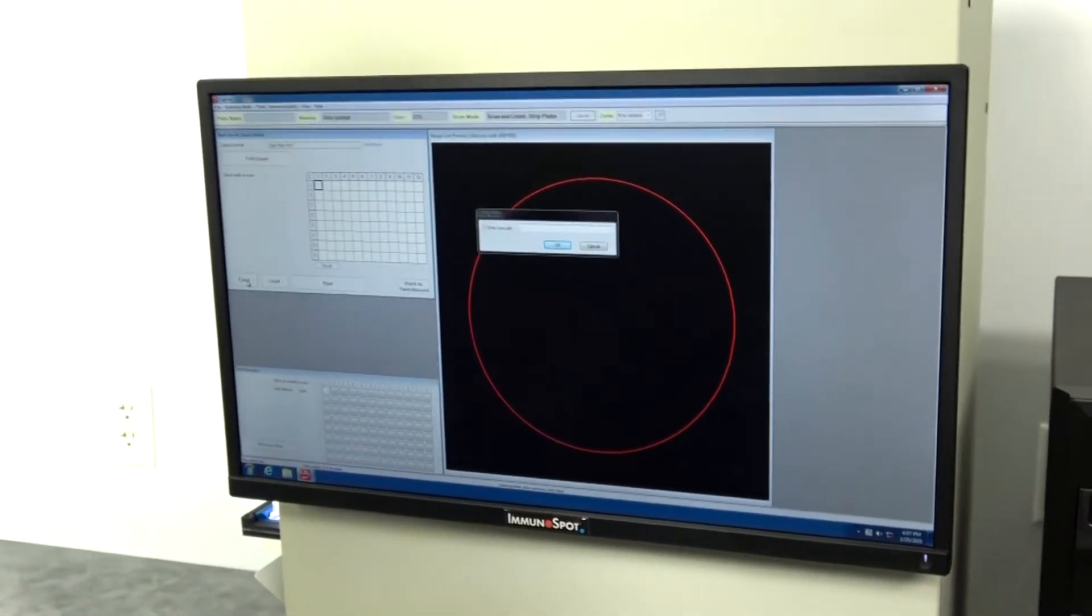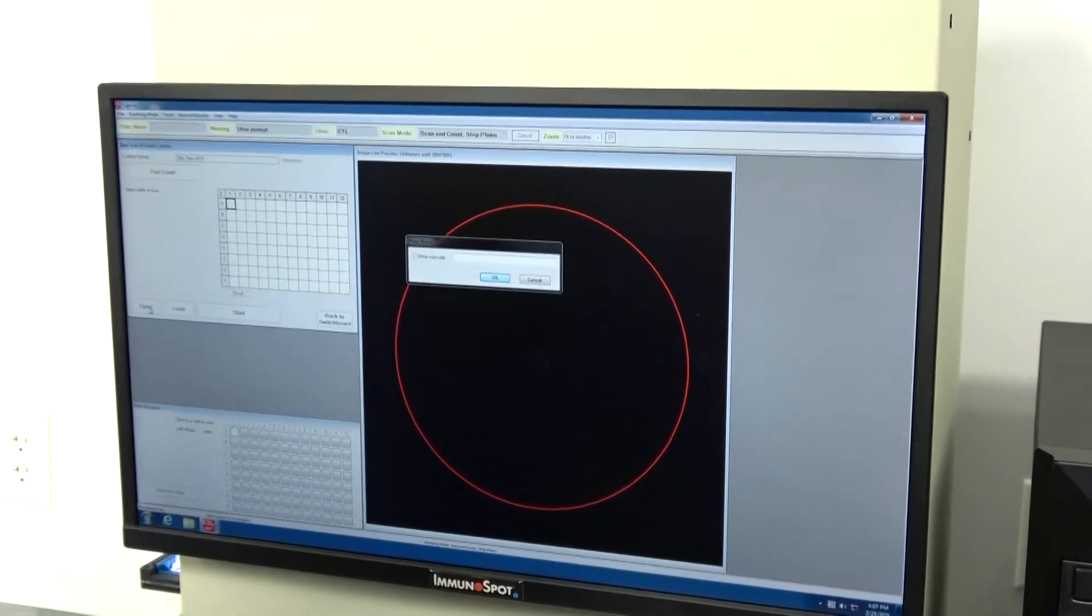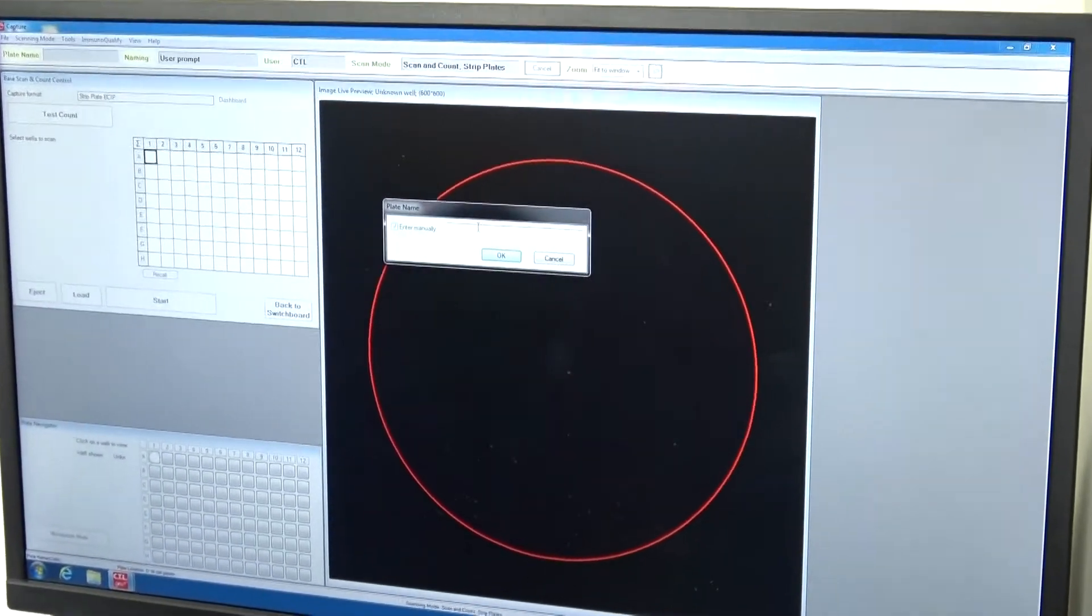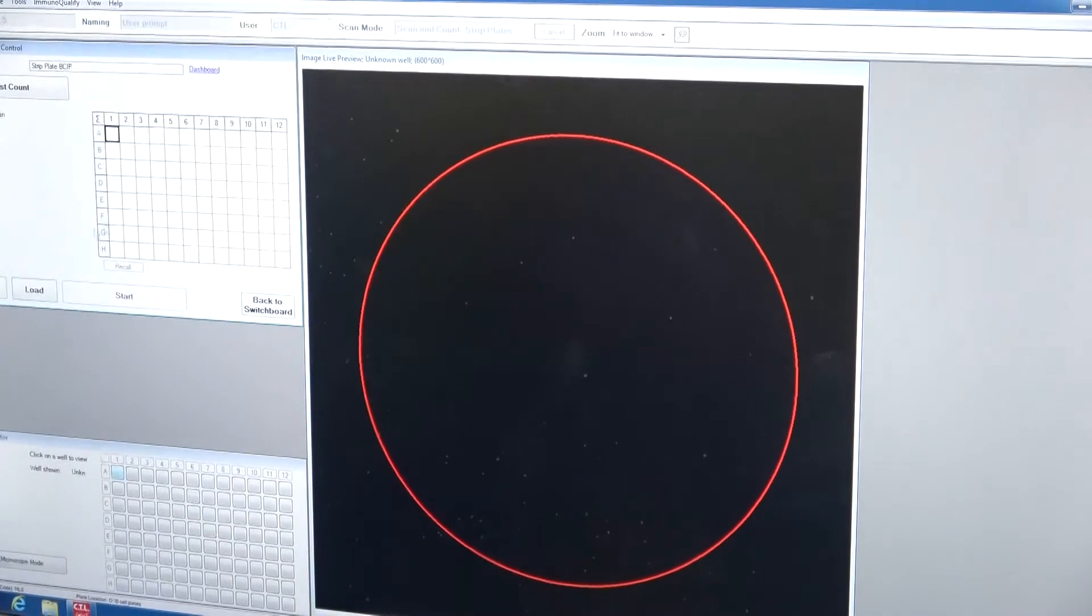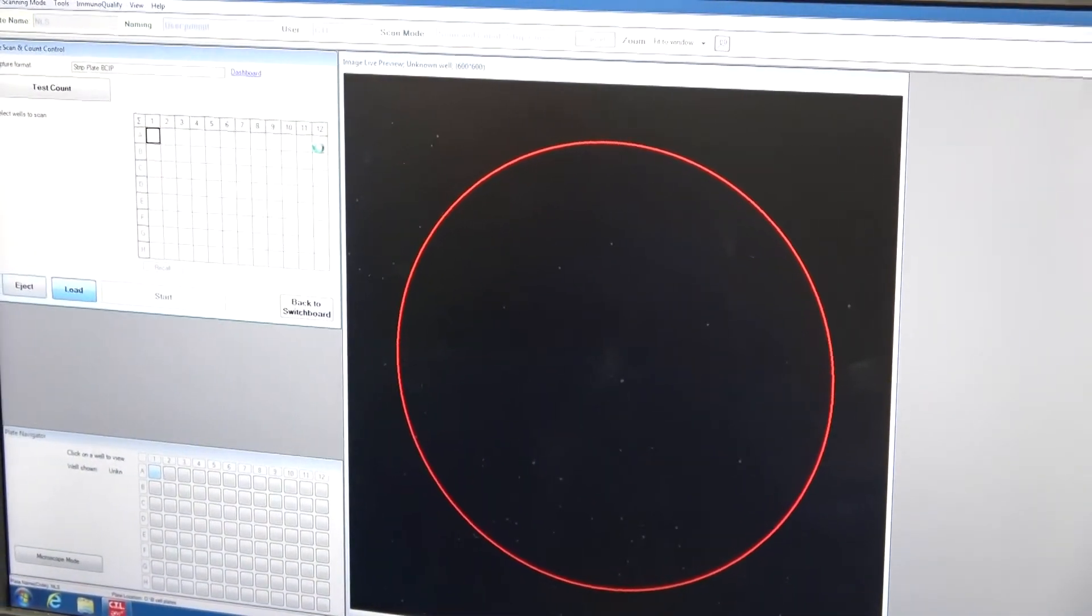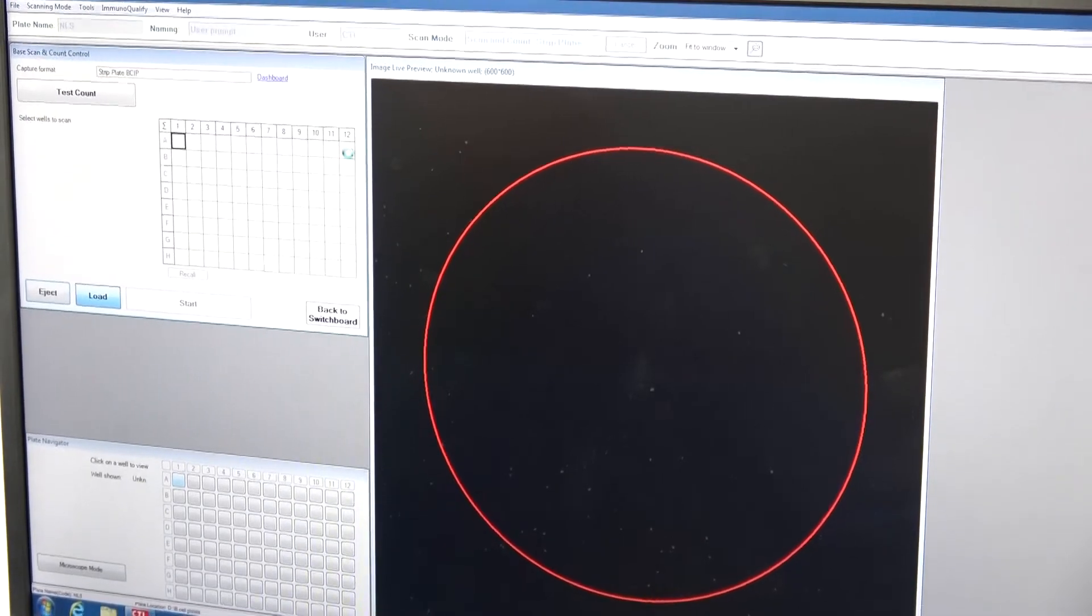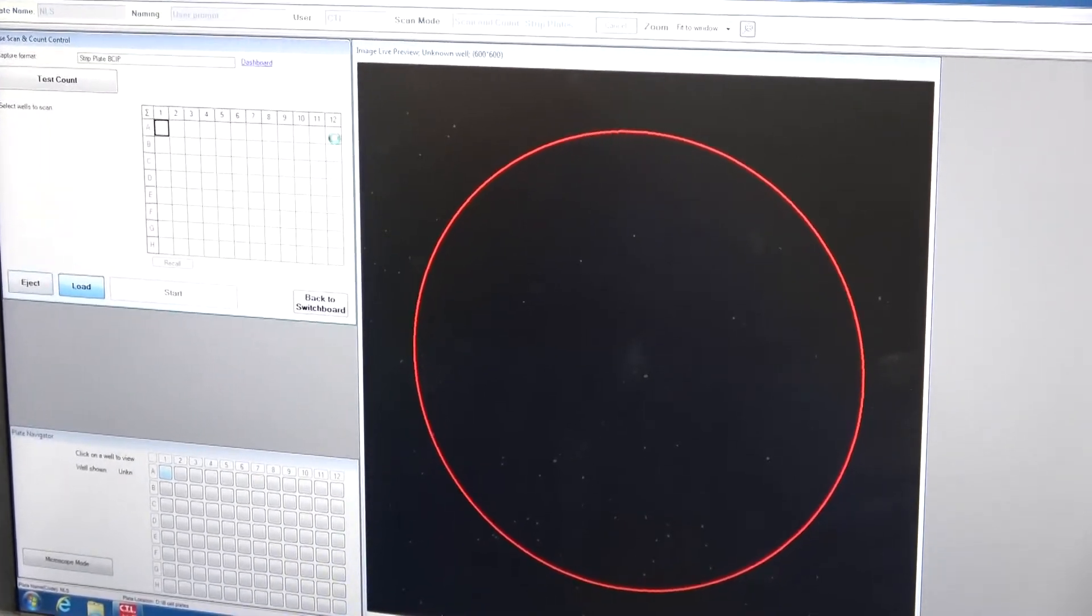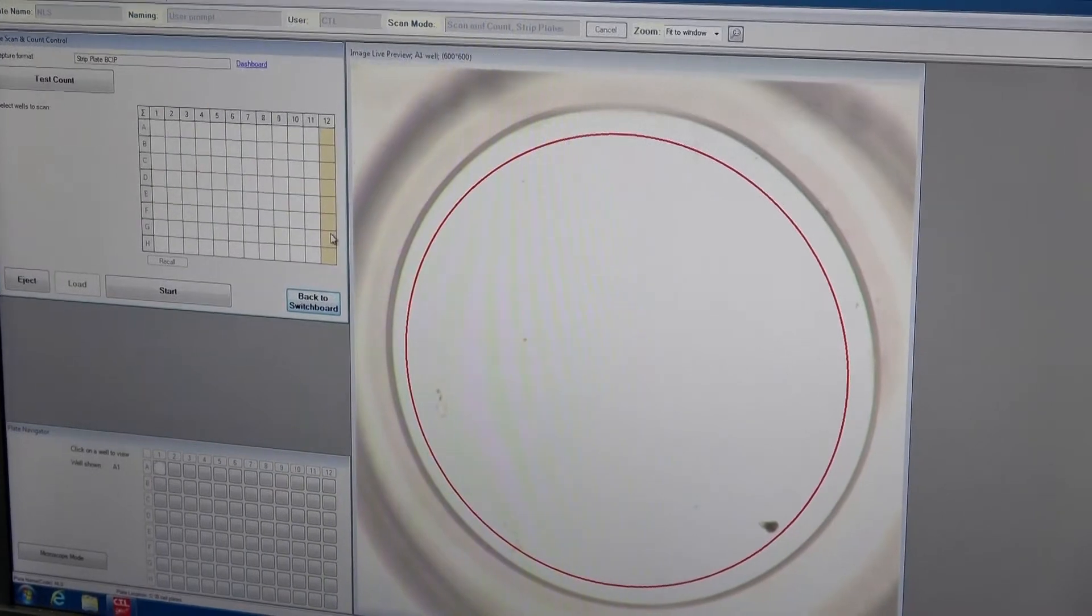We can give this unit, this plate, a name for testing purposes. Now we're going to go ahead and load that and tell the unit that we want to scan row 12.